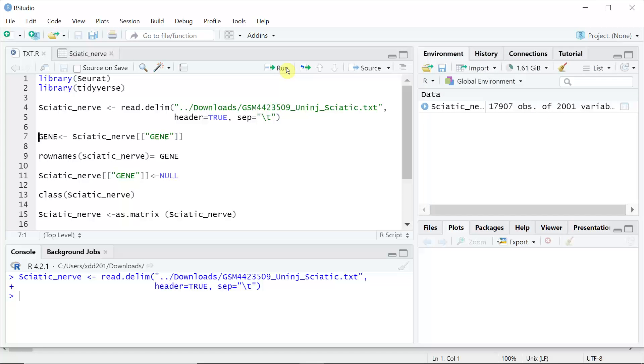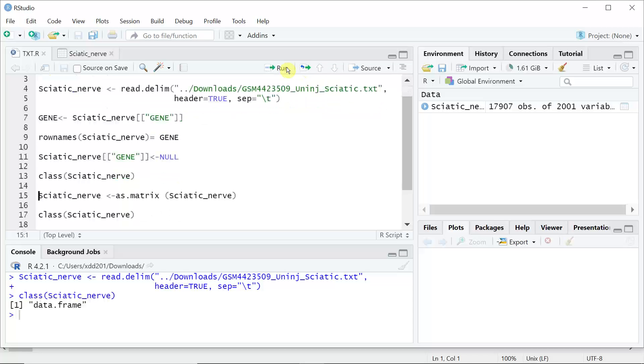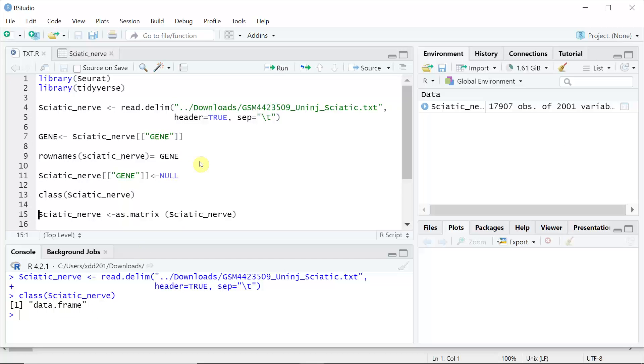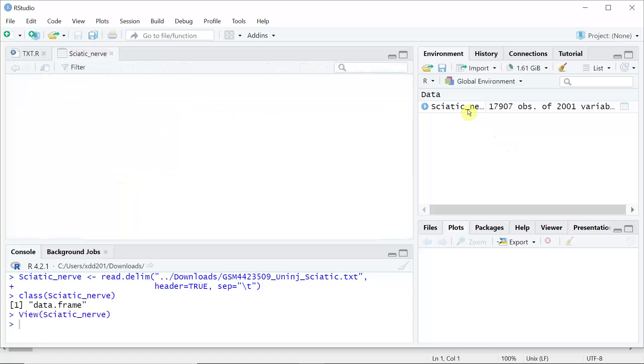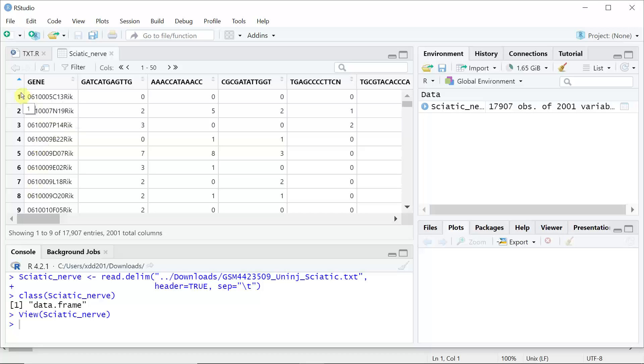You can see we created a data frame. If we see the structure, the data frame we named sciatic_nerve, you can see it is a data frame. Let's have a look at the data frame. You can see the gene names are in column 1. They are not in row names.